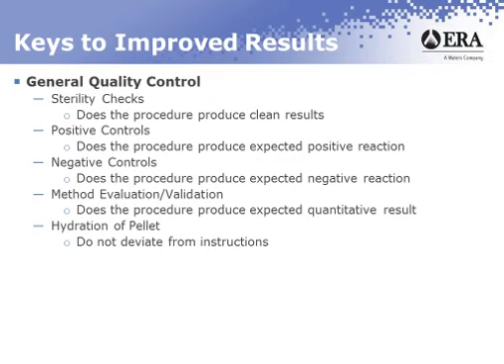If you decide to do it in a way that is completely different from your peers and you're a participant in that study, it's possible what you do could produce a result that is different just because you were off on your own doing something different. So it's really important to follow the instructions that you're given.